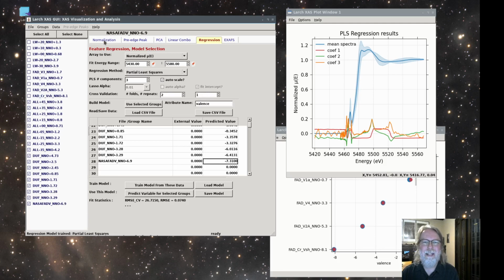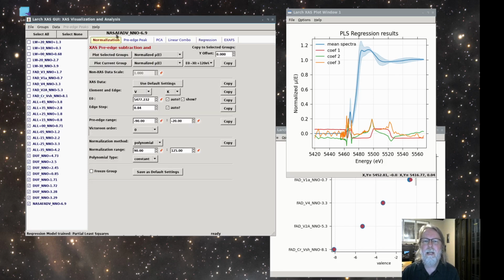I also can imagine that it will be hard. You might be scratching your head and wondering if you can actually apply this to your data sets that you have right now. And maybe that would be hard to do, but I hope that at least you keep this in the back of your mind as something that you might be able to do, and the kinds of things that XANES analysis can be used for.